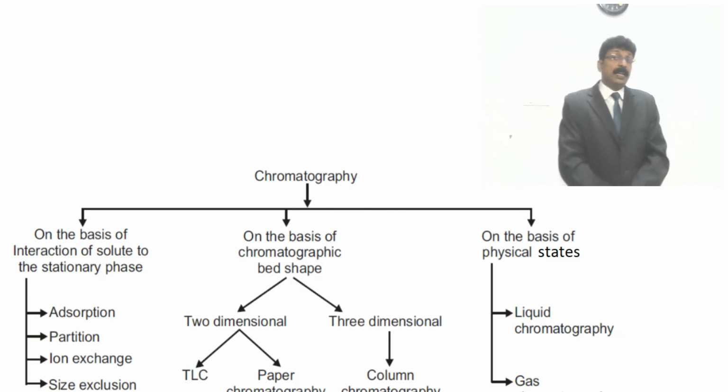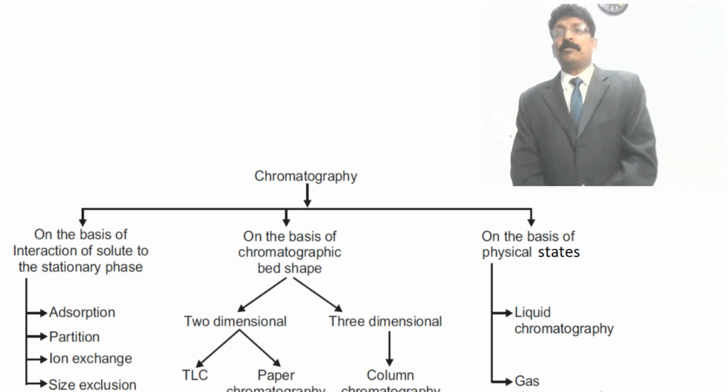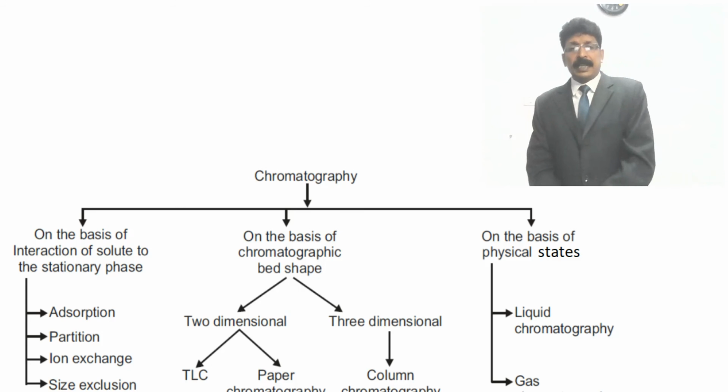It can be done in TLC and paper chromatography, and it can also be done in three-dimensional chromatographies, and on a large scale in column chromatography also. Various techniques are to be followed.